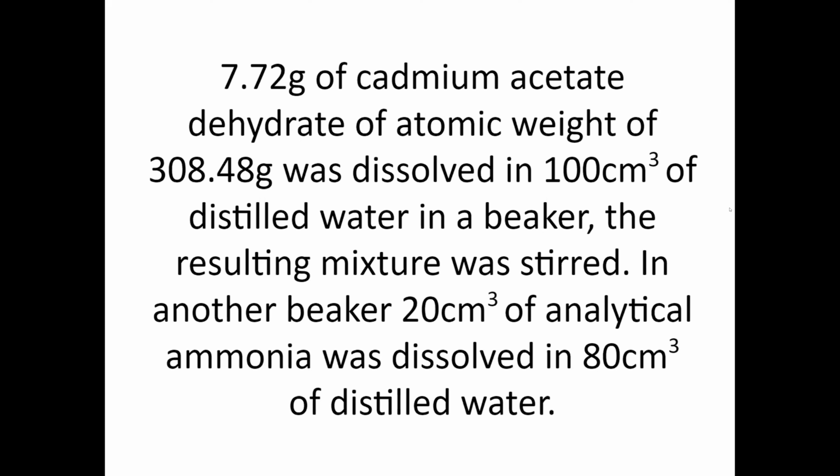7.72 grams of the cadmium acetate was dissolved. You can see it on the screen here, in the distilled water. And again, the same thing was done. You can see the precursor, sodium hydroxide, was used also. Only 4 grams of sodium hydroxide was dissolved in the distilled water, and 20 centimeter cube of analytic ammonia was equally dissolved in 80 centimeter cube of distilled water.